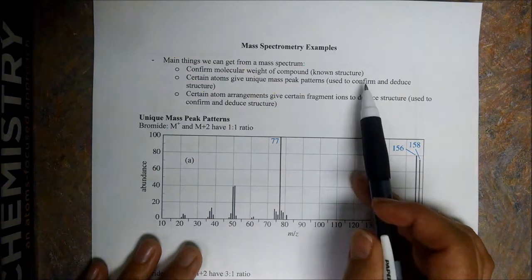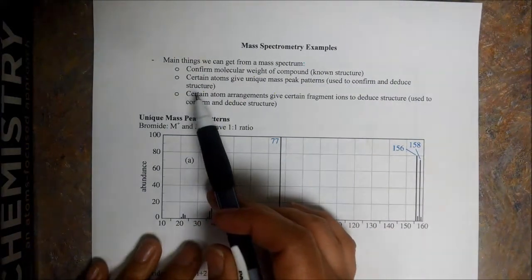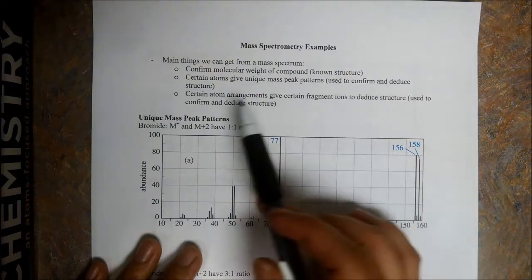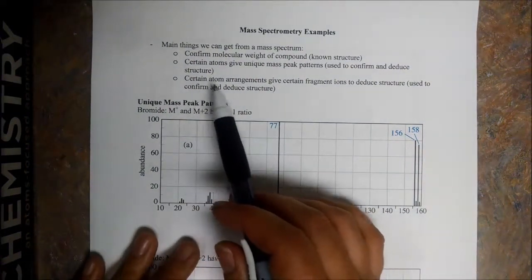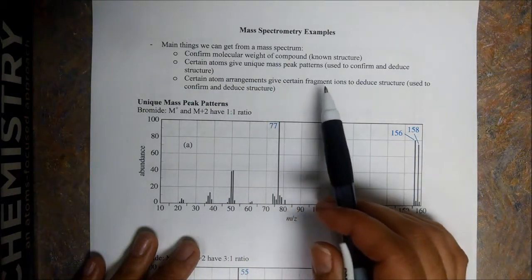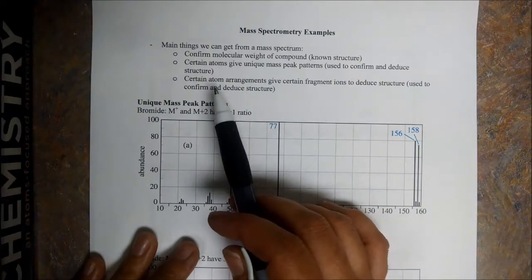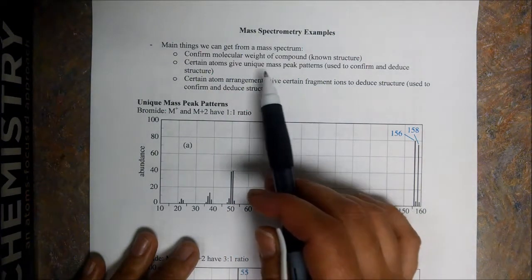Because if we think they should be there, then they should be there. Or we can also use it to deduce the structure. So let's say we have an unknown compound. Again, we can use these mass peak patterns to deduce something about the structure of that unknown compound. And then also certain atom arrangements give certain fragment ions. This is kind of like the unique mass peak patterns, but this is more so dealing with carbons, and up here I'm talking about other atoms.